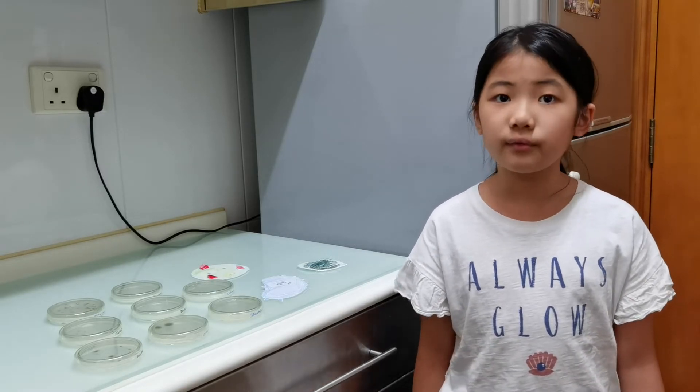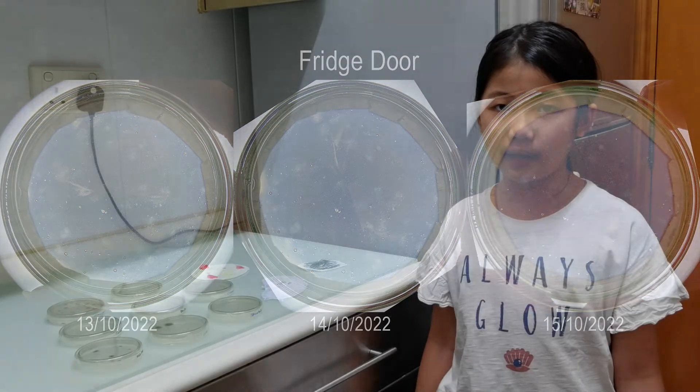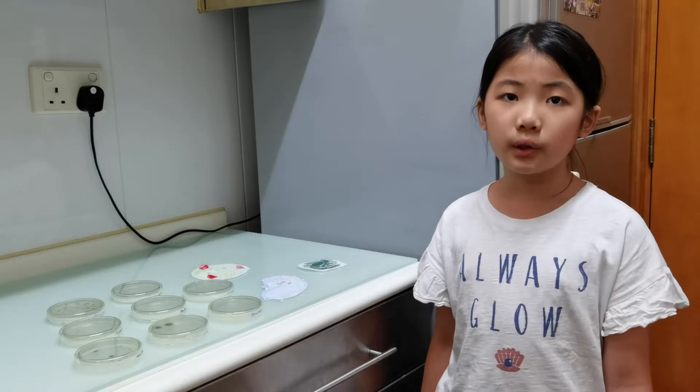In the kitchen area, the sponge and the fridge handle were surprisingly clean and they also have no colonies found. But the cutting board was the dirtiest of all. It has about 400 colonies of bacteria and over 90 colonies of fungi.